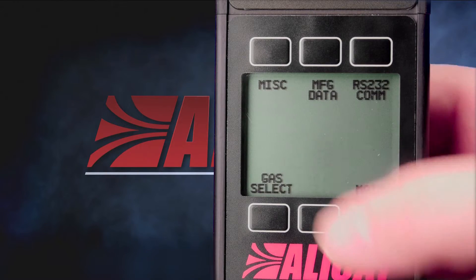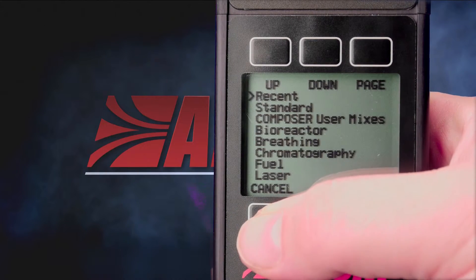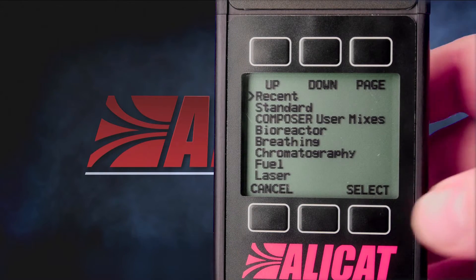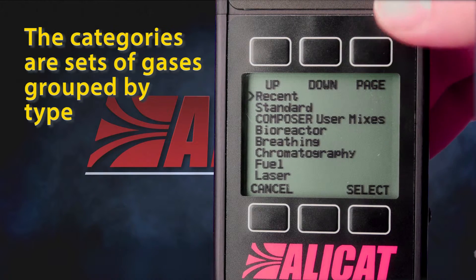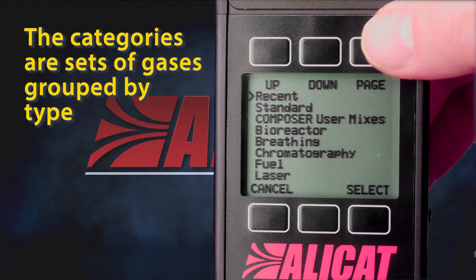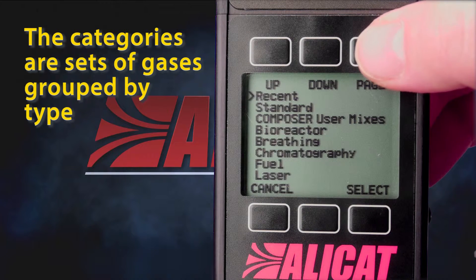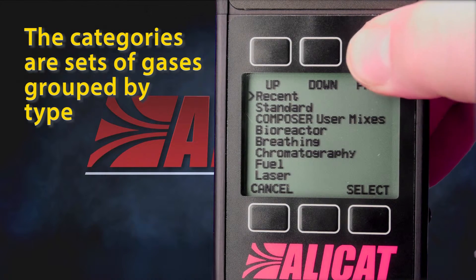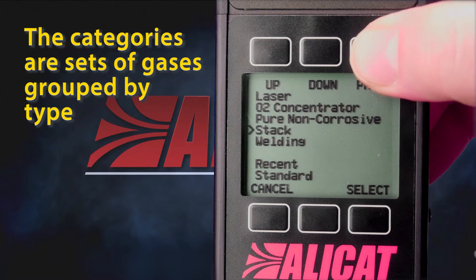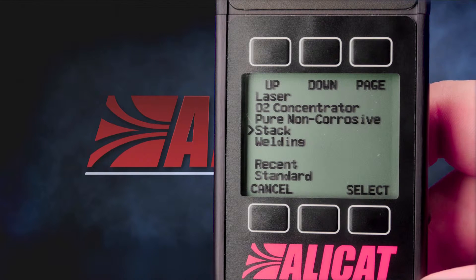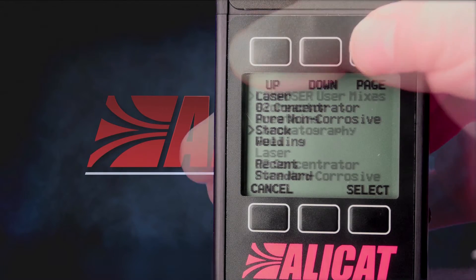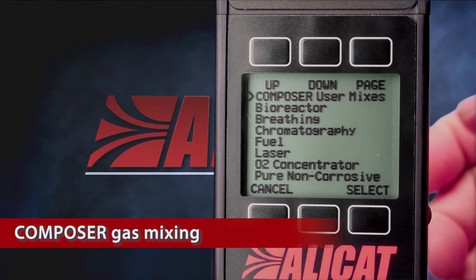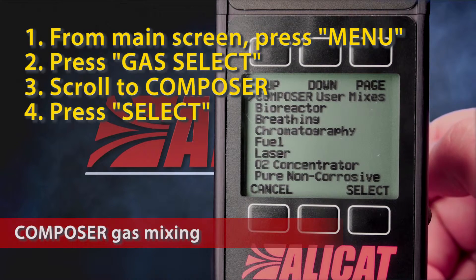Let's go back and look at that gas select list again and take a look at some of these other categories. We can use the page option here. Among this list we have standard gases, breathing gases, chromatography gases. There's also laser gases and pure non-corrosive gases. Lots of options to choose from. Now among these choices is the Composer user mixes choice.